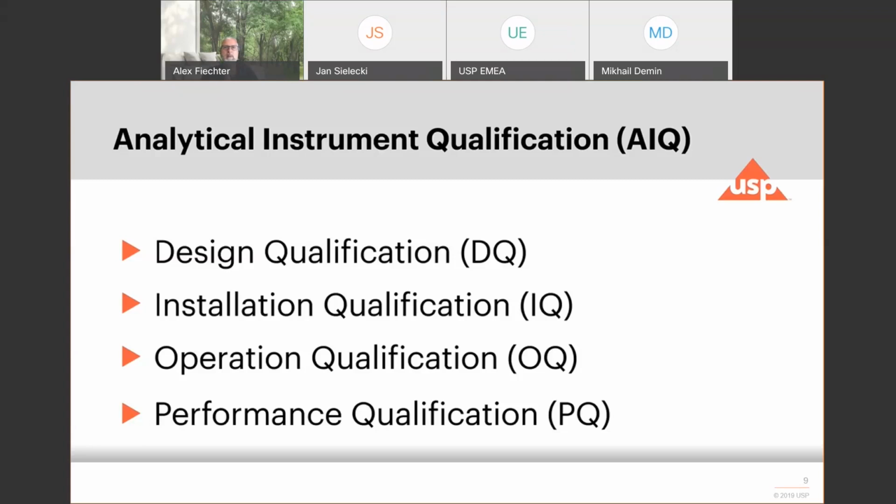So narrowing down the specifications for up-to-date equipment is only a logical procedure. Having said this, this is all fine, but this alone wouldn't give you the whole story of the performance of the dissolution test. So that's why we do on top a holistic test, a so-called umbrella test, which is the performance qualification that makes sure that everything that is applied to the dissolution tester is working in accordance.